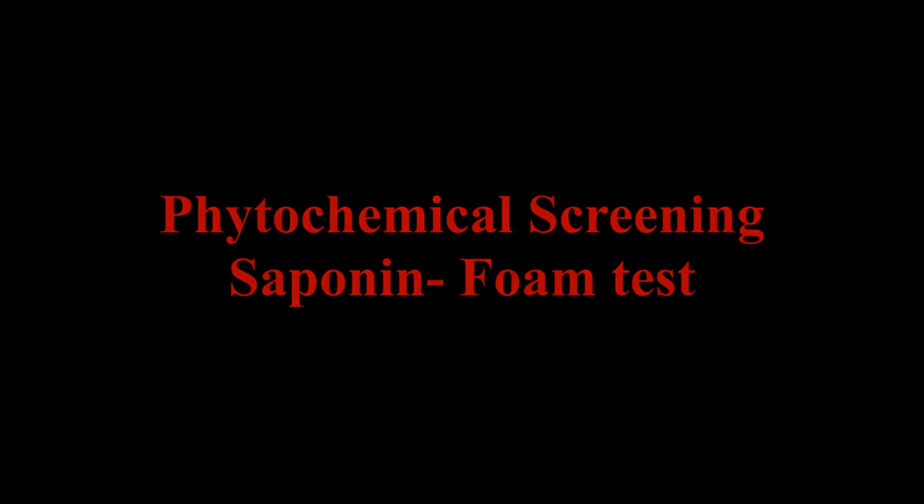Hello friends, welcome to the General Solution. In the phytochemical screening series, today we are going to perform saponin foam test.